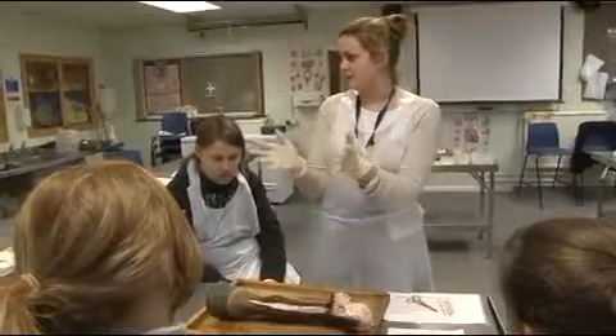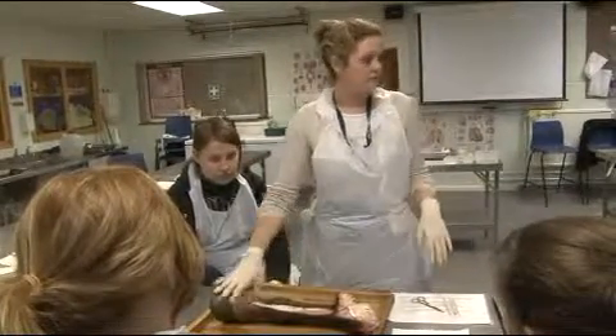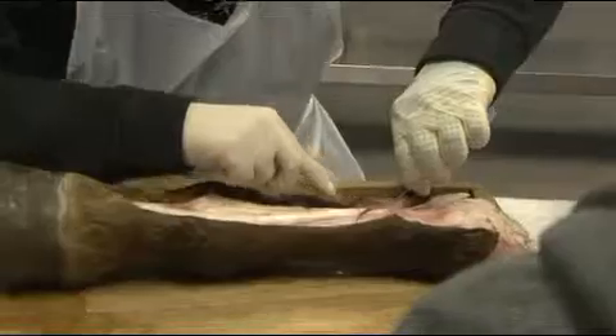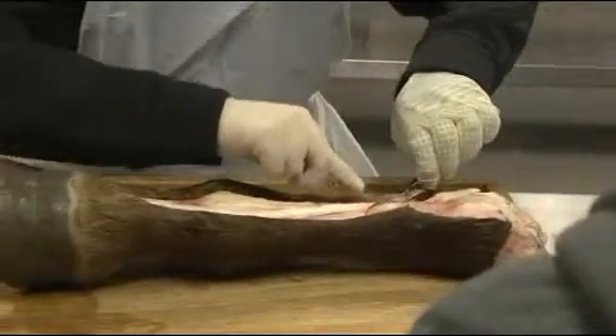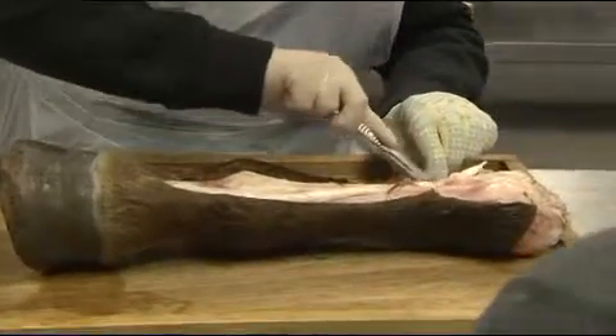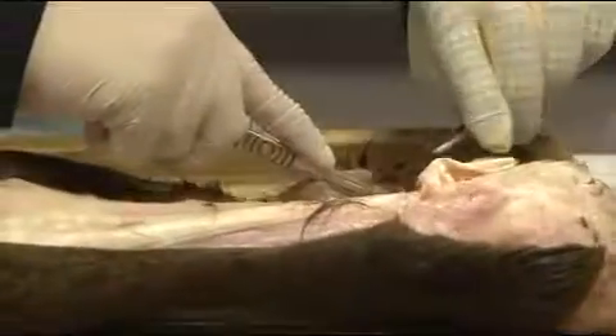Normally you can get the skin off in one, so you have a nice little patch. Is everyone happy with how to do that? If you guys start on the skinning process then — who wants to go first? That's your common extensor tendon. That's what controls the movement of the hoof. So you've got that tendon there, and then afterwards we're going to look at the ones at the back.